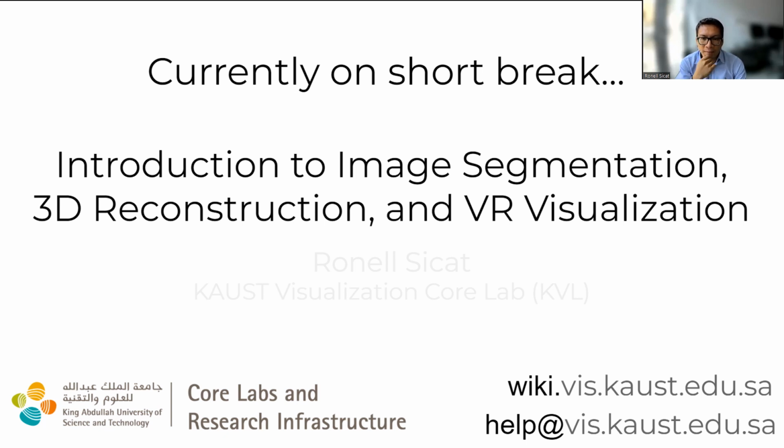And if you don't have access to a machine, you can use IT's remote workstations, or you can also book our VR machine in the showcase that I showed earlier. So you can use that to use Avizo and then directly use virtual reality with Avizo.